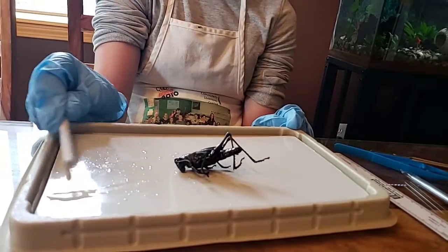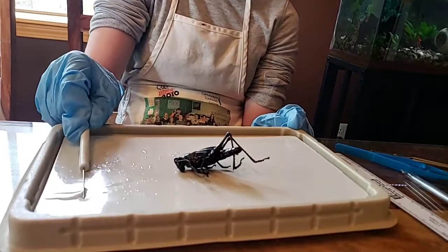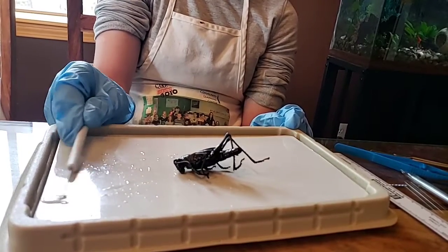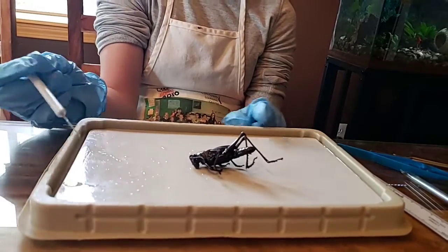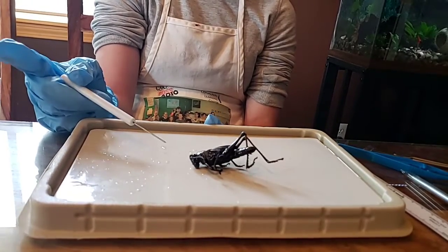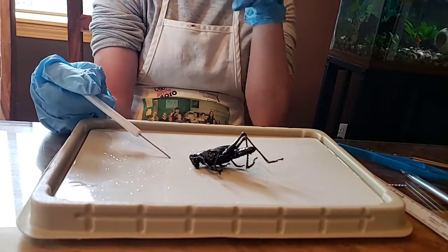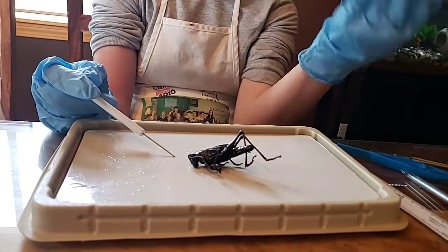All right. Moving on to number 5. Observe the mouth and feeding appendages. The mouth contains a pair of mandibles and 2 pairs of maxillae. What are maxillae? I have no idea. Think about the crayfish. What were they? Weren't they those things like the spiders have? Yeah, they're almost like little hands around their mouth to help bring food into their mouth.